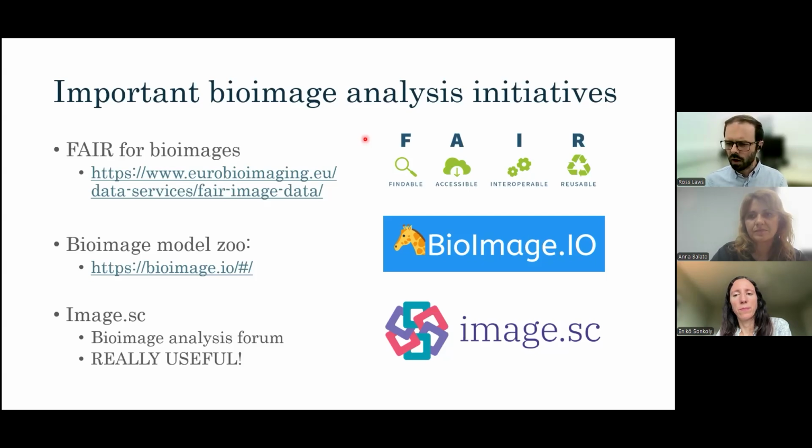Whereas people who do connectomics, so neuronal data analysis, will sometimes look at volumes of the block face that they're cutting away that are over 100 microns or more in size, and then reconstruct all of the neuronal connections within that data, or try to anyway. They can't look at those things in cryo-EM because the scale's just so much smaller. So it basically gives you a lot wider region of interest, but not necessarily as close to the native state of the tissue and cells.